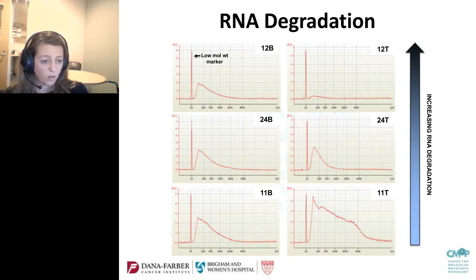But then as you look towards 24 and then go towards 12, the amount of actual degradation increases substantially as you go up through these samples. Sample 12 is the worst sample in terms of degradation that we actually ran, and sample 11 was representative of maybe 20% of the samples. So we had more looking like this, but we had a couple that were really low.